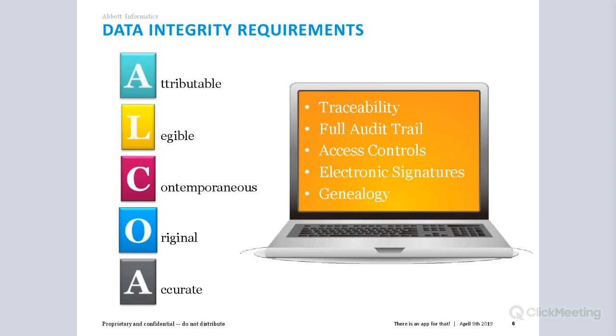And finally, accuracy requires no editing to be performed without it being documented, exactly what a LIMS handles out of the box.